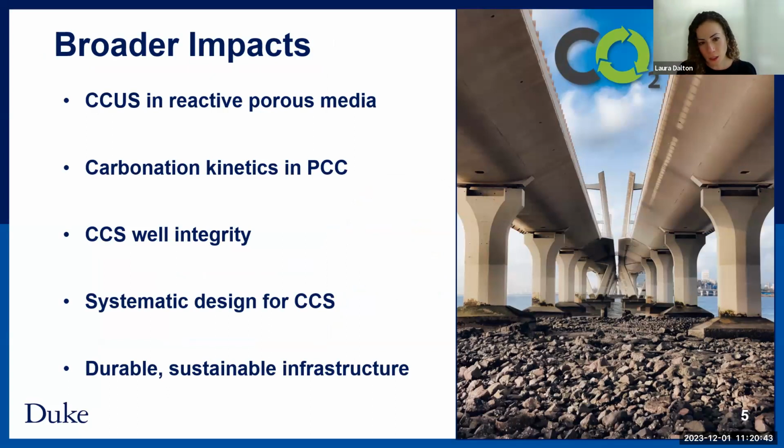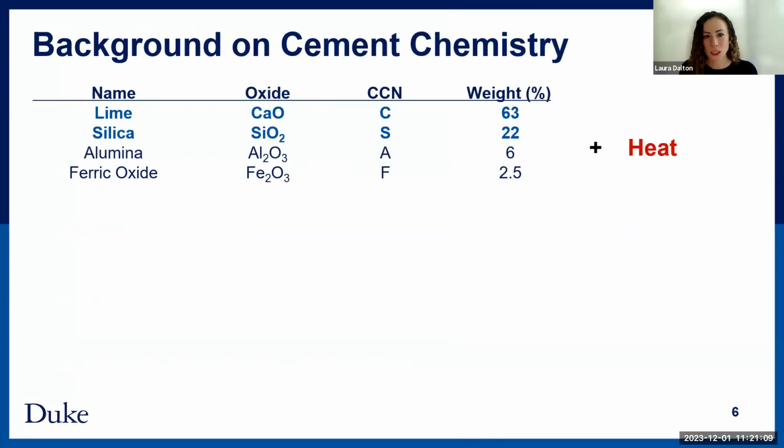So, and carbonation connect, right? It's all interrelated to really just how can we put CO2 out of the atmosphere and permanently store it through mineralization as calcium carbonate back in these geomaterials. And we're really trying to look at, can we systematically design carbon capture and storage in materials or to promote it over time. So that's really what my group is working on.